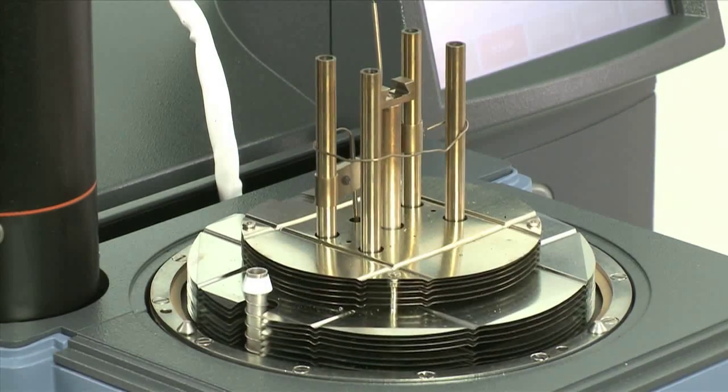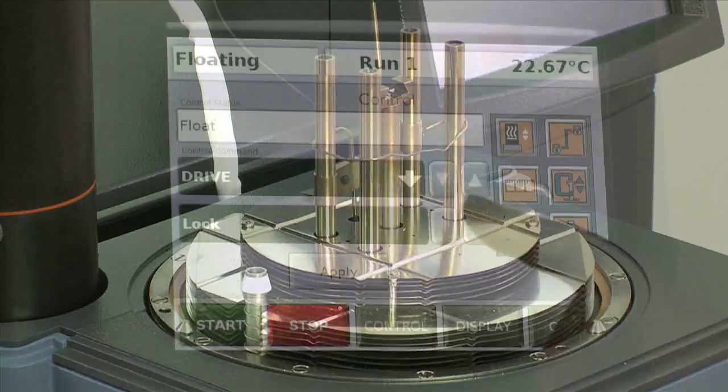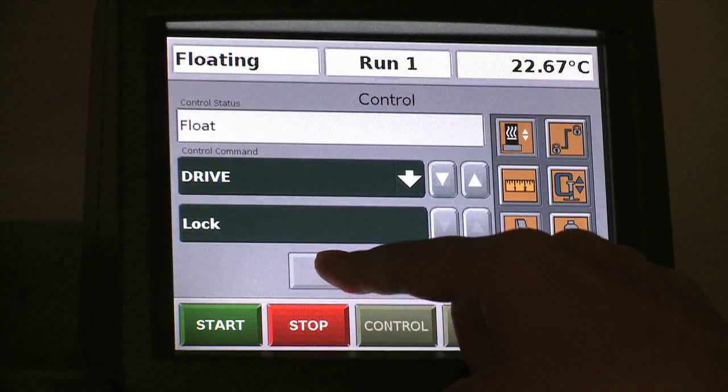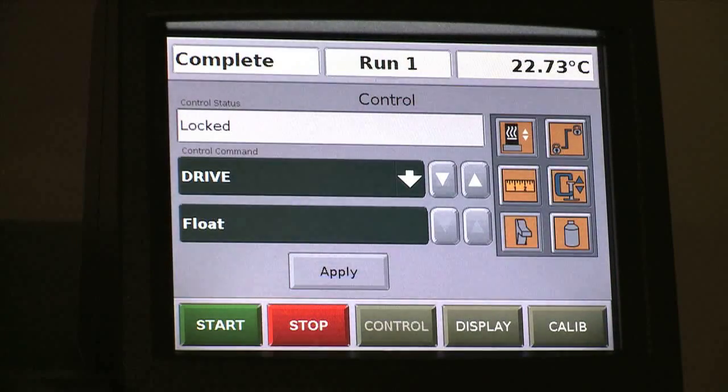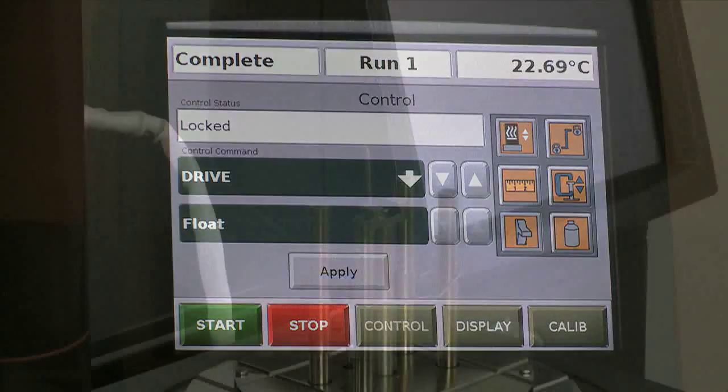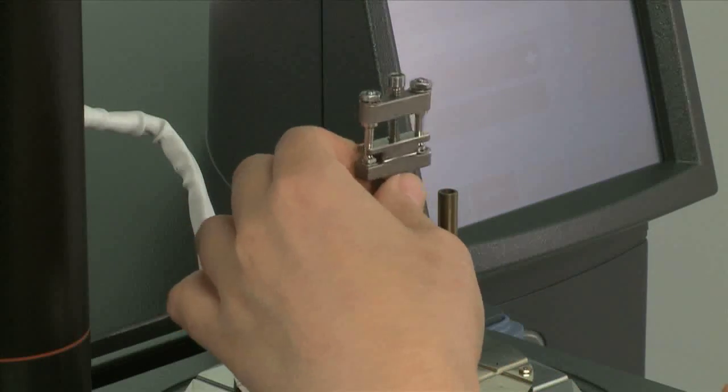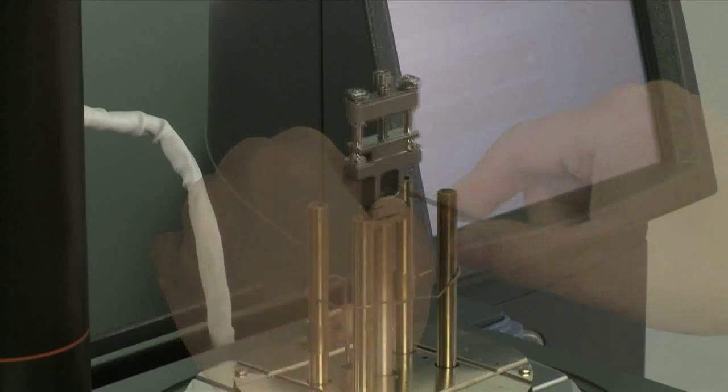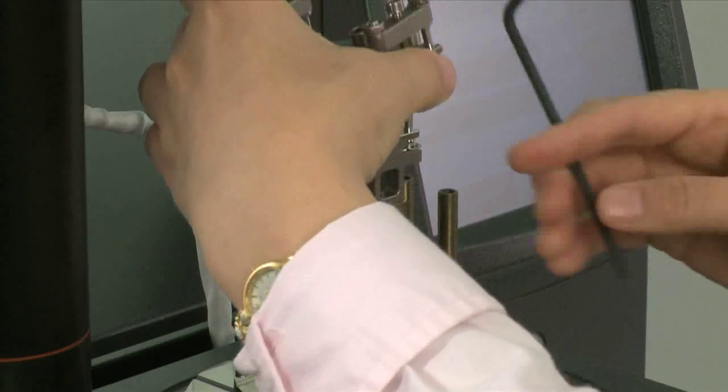Before calibration, we shall first install the clamp to the instrument. From the touch screen, lock the drive shaft. Install the movable clamp to the drive shaft, then install the stationary clamp.